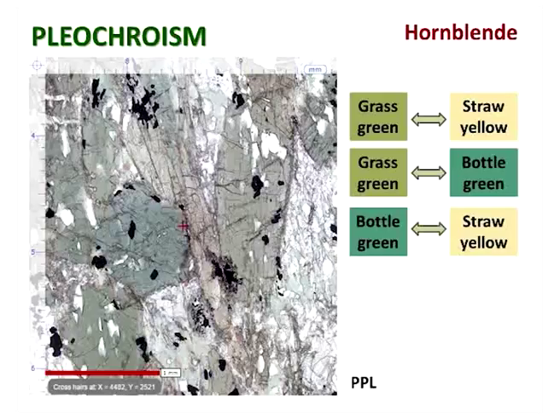So this is hornblende, which is an amphibole, very common amphibole. And again, this is rather more subtle. It shows three different main colours. There's a kind of what I've called bottle green, which is slightly bluish or greyish green. Then there is a kind of grass green, or more of an olivey green, which is this long crystal here, the prismatic crystal on the right.